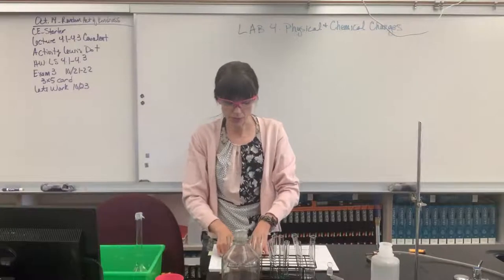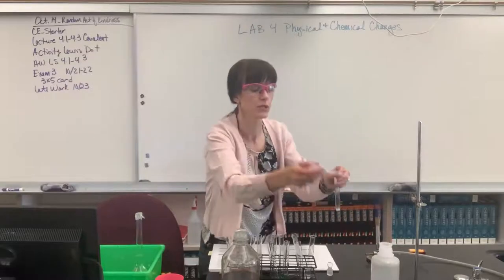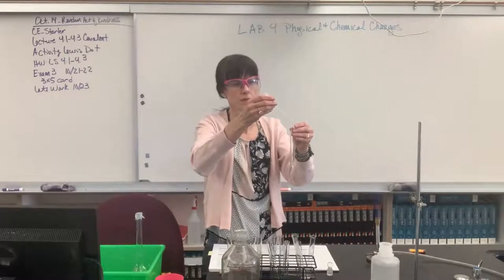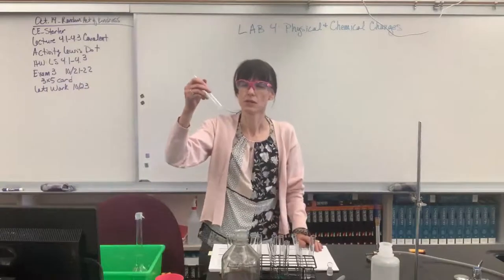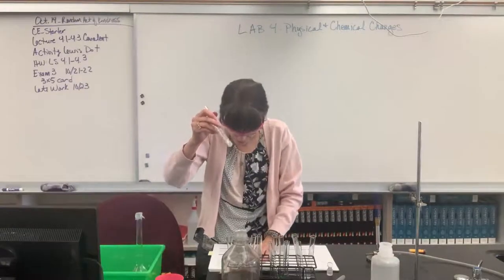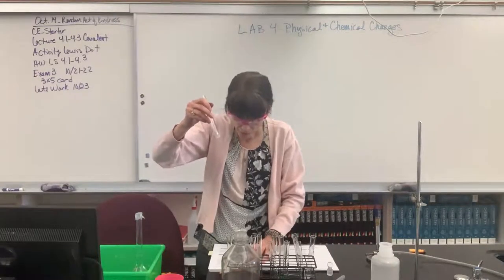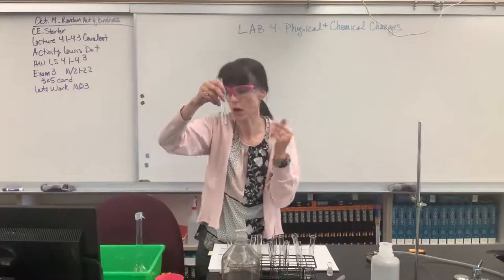Now it says add 30 drops of distilled water to one sample. So let's get my little pipette for water and we're going to count 30 drops. 1, 2, 3, 4, 5, 6, 7, 8, 9, 10, 12, 13, 14, 15, 16, 17, 18, 20, 21, 22, 23, 24, 25, 26, 27, 28, 29, 30. Okay. Now dissolve this. So I'm going to mix this and keep reading. Test the solution formed in step two by adding 6 drops of a 0.1 molar calcium nitrate. Okay, it's dissolved, it's just clear. It just looks like clear water.